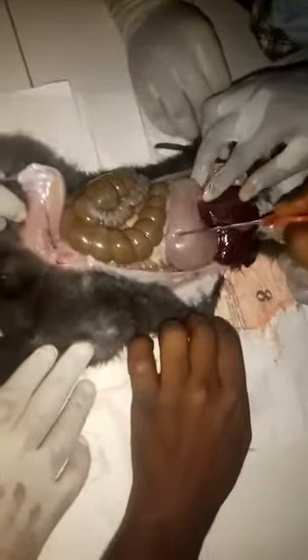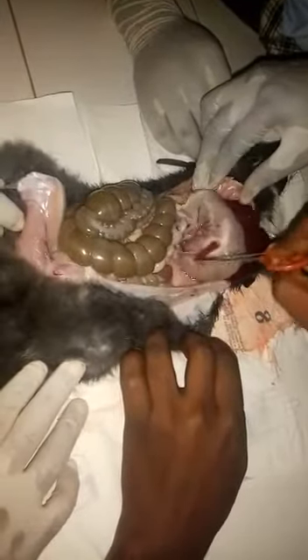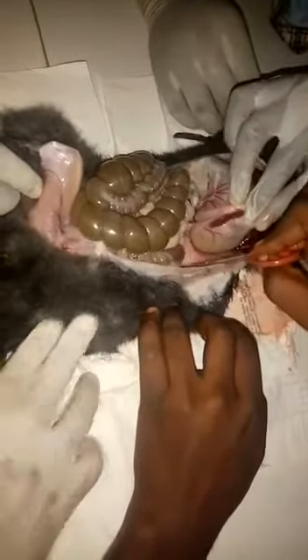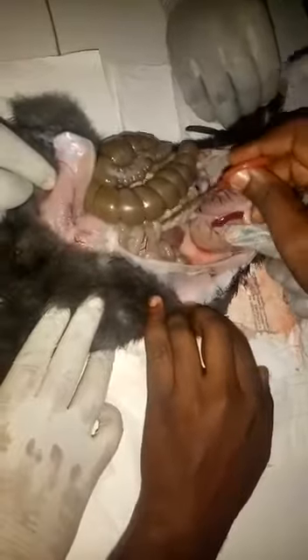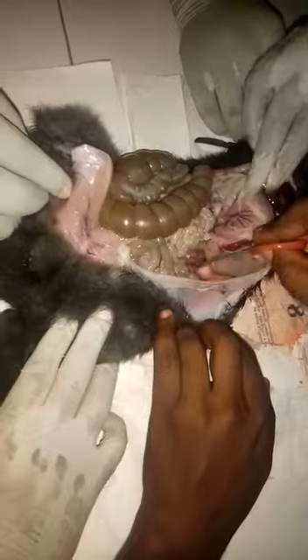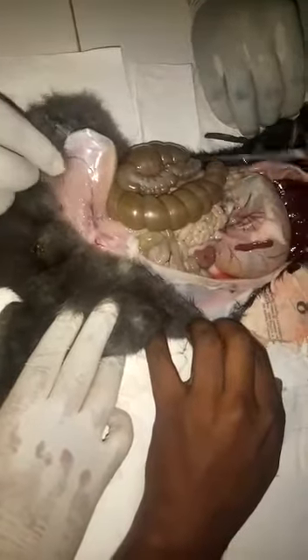And this is the stomach. Very good. This is the stomach. Excellent. All right. Then see the kidney. Then this is the left. This is the what? Left kidney. Right kidney. Left. Right. Left kidney. This is the left. It's supposed to be left. Keita, it's the way you are standing that is making you look at it as if it's the left. This is the left kidney.